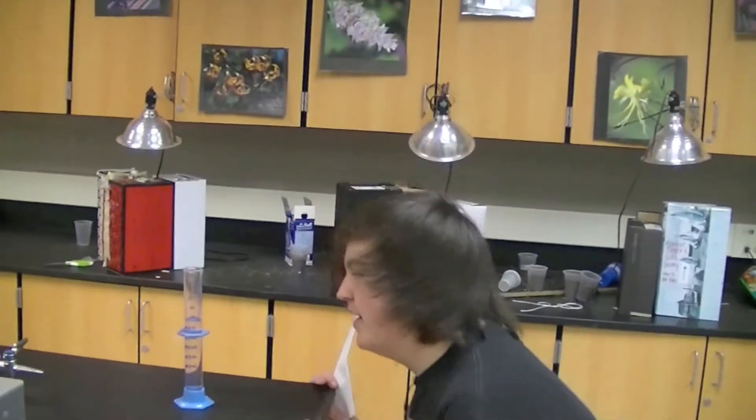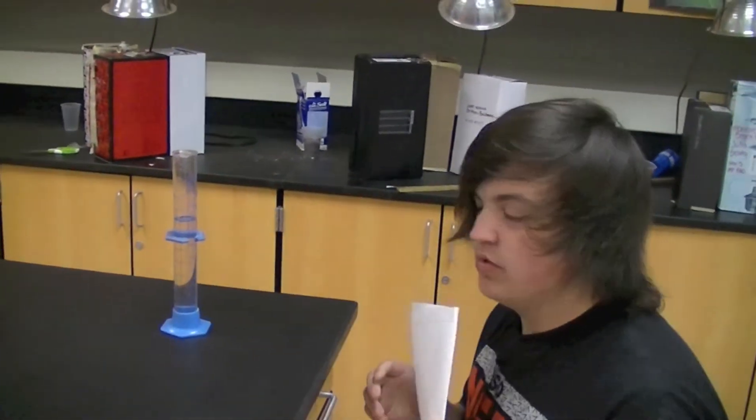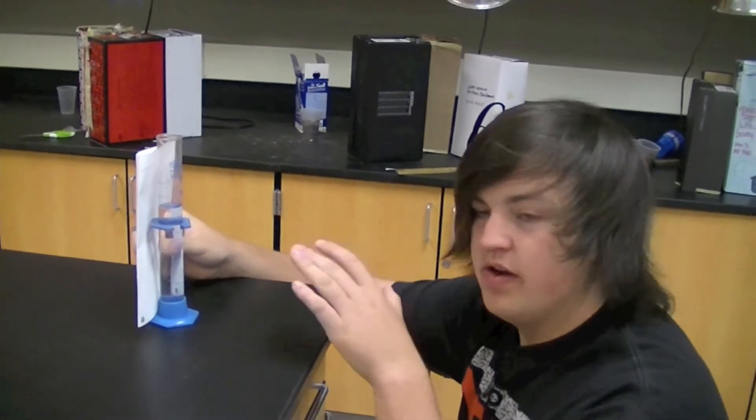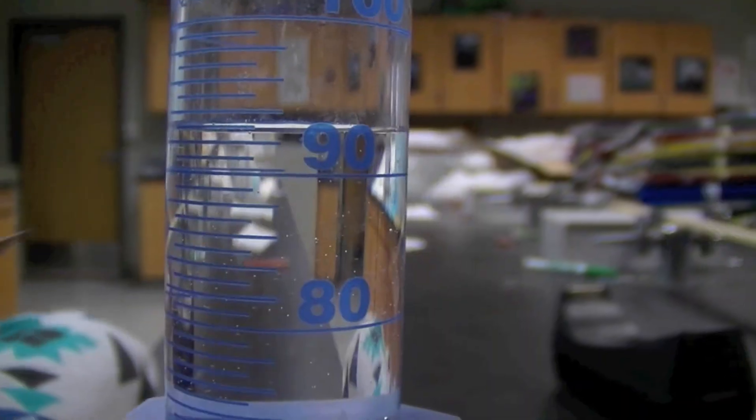So you want John's amazing tips? Well, check this out. As you're reading your graduated cylinder, there's a really cool trick you can do. You can put a piece of paper behind it on the very backside and it will help you read.